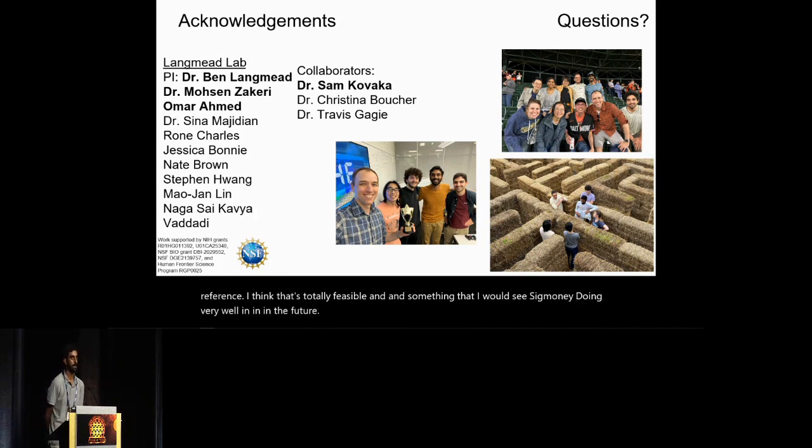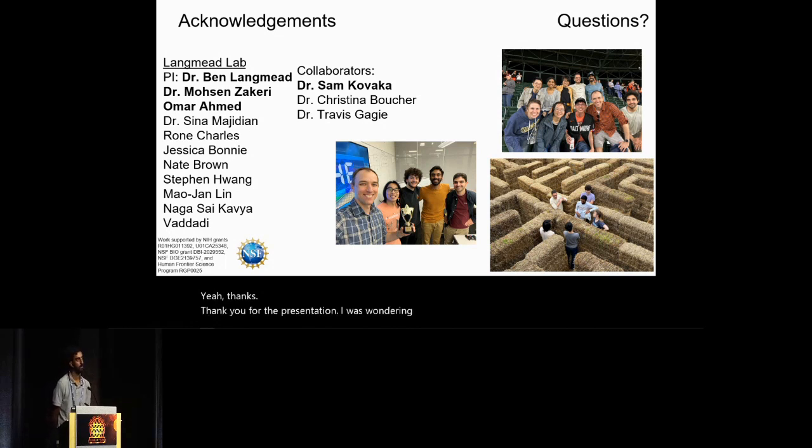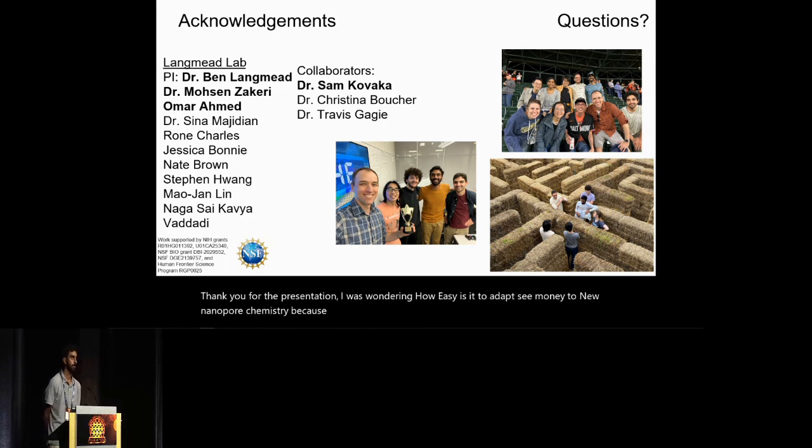Yeah. Thanks. Hi, thank you for the presentation. I was wondering how easy is it to adapt Sigmoni to a new nanopore chemistry? Because with the new chemistry, you're reading 9-mers, so you have a larger search space if you convert your reference with the pore model to signals.